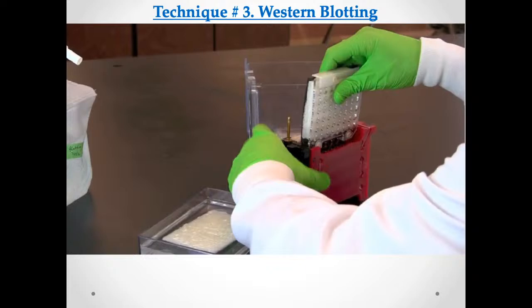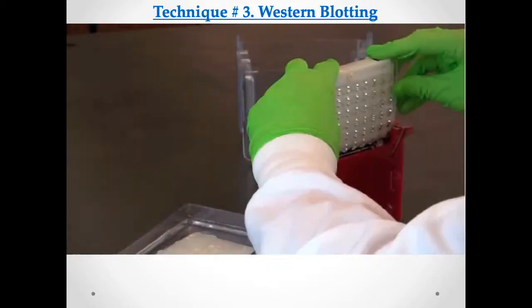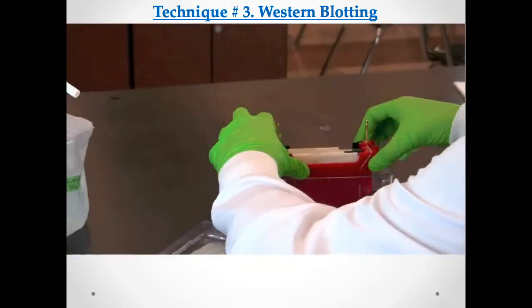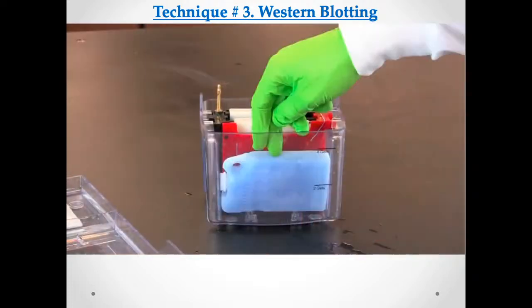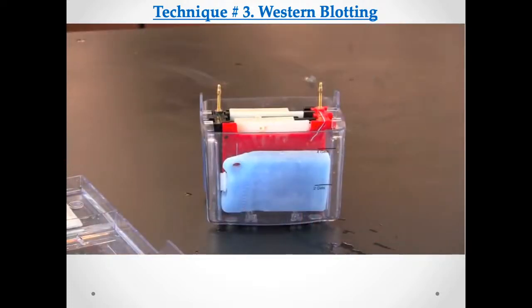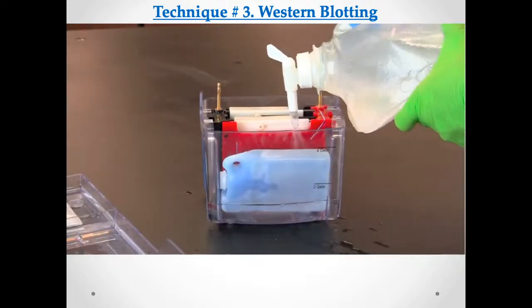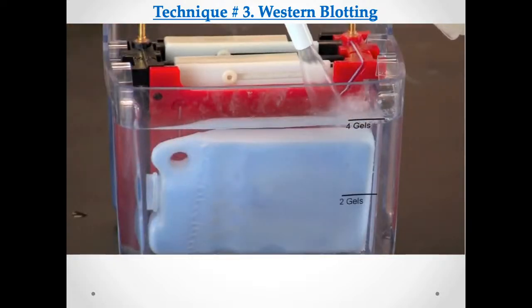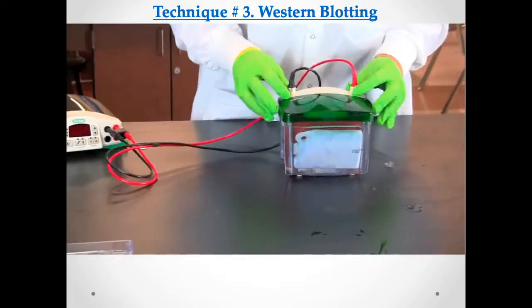Insert the gel holder into the inner module. Make certain that the black side of the gel holder is next to the black side of the module. Place the inner module into the electrophoresis chamber. Add a frozen cooling unit and fill the chamber with blotting buffer to the level of the white clip on the gel holder. Place the lid on the electrophoresis chamber.